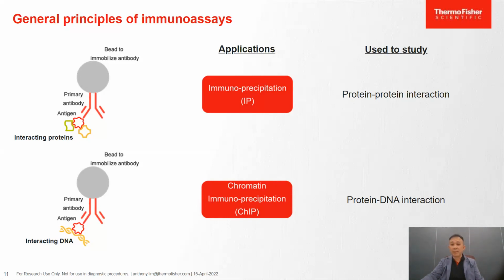Immunoprecipitation was first developed as an adaptation of the traditional column affinity chromatography, with the idea to isolate just enough protein or DNA to be able to measure it by Western blotting or other semi-quantitative or quantitative assay methods.